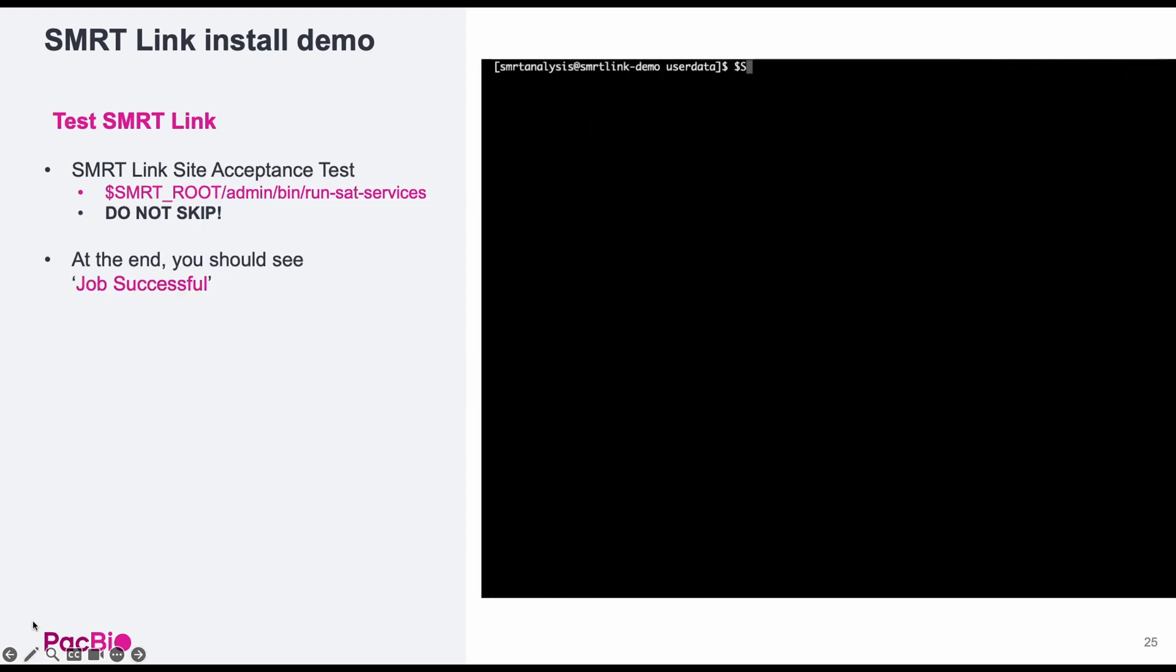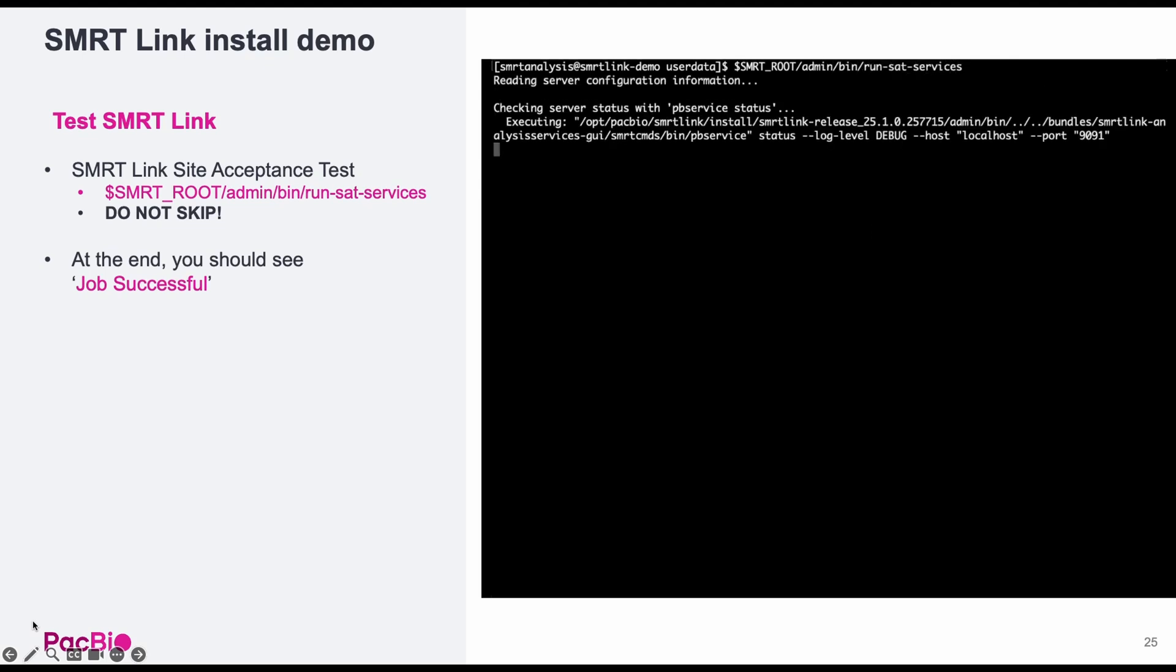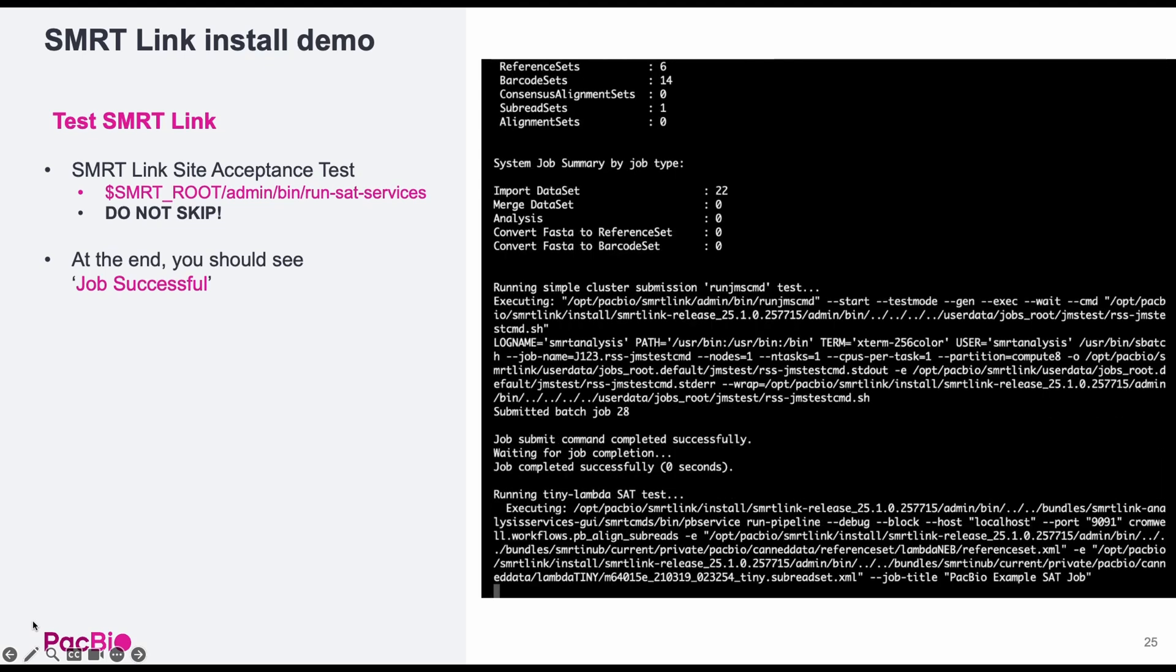Back in the terminal, the last thing we need to do is run a site acceptance test to confirm SmartLink is working properly. At the end, you should see job successful.